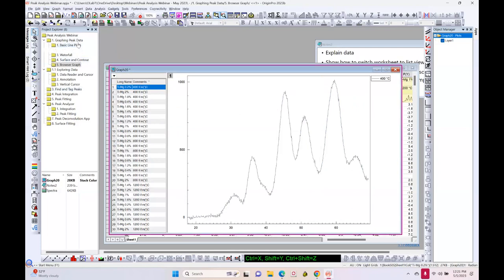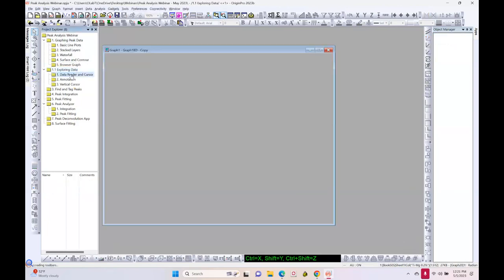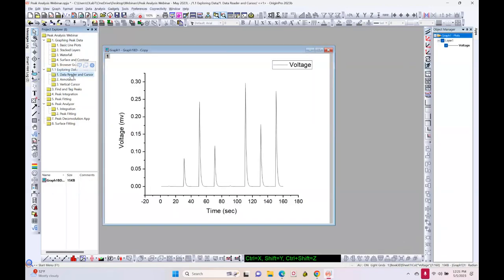I hope this section conveyed a flavor of what can be done with peak data in terms of plotting in Origin — there are so many different templates available. Let's now move on to some data exploration techniques. Questions and comments — please feel free to use the chat window or Q&A window.